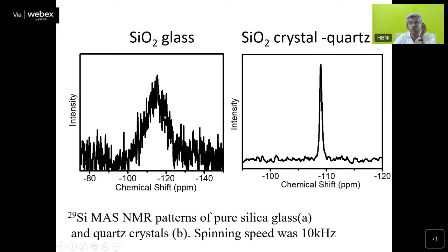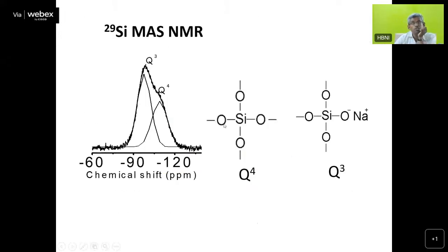This minus 1. This is a very qualitative way, but still we can identify in the glass that there is a silicon structural unit with 4 bridging oxygen atoms. Now if you add sodium, what happens? Sodium has to be accommodated in the glass because glass is a homogeneous matrix, unlike a crystalline material. So how will sodium oxide be accommodated in the glass? It will try to convert the bridging oxygen into non-bridging oxygen.